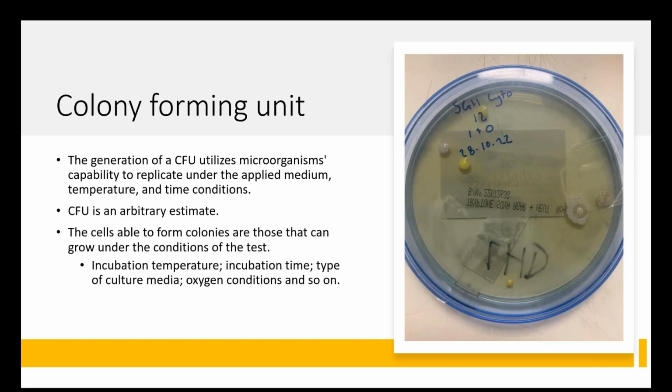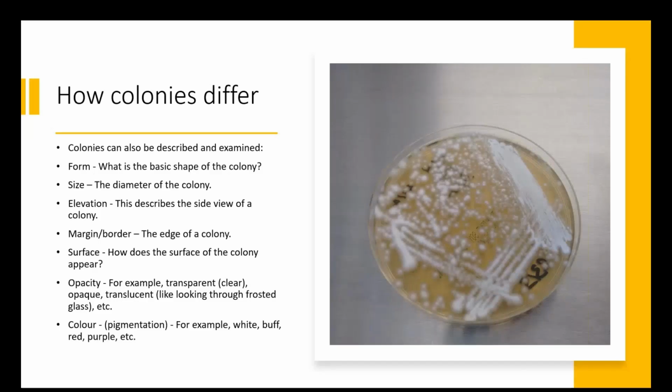And also we can have more than one organism that's come together that appears to form one colony. All we get is the representation of that colony. We also have different ways to describe organisms in different colonial states, and we may have typical and we may have atypical growth patterns. And there are some descriptors that we can use to capture that.